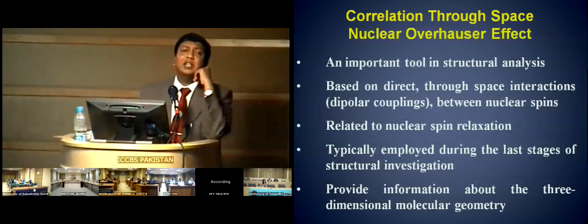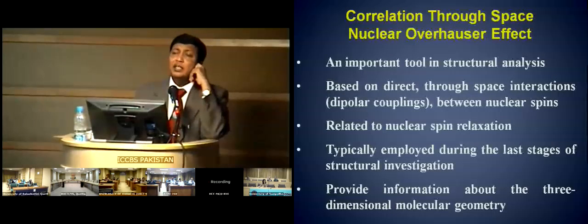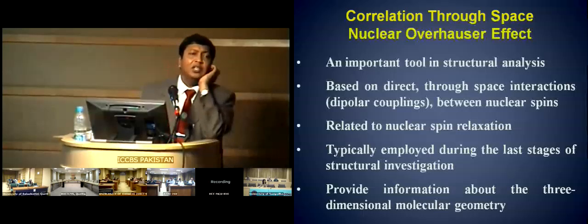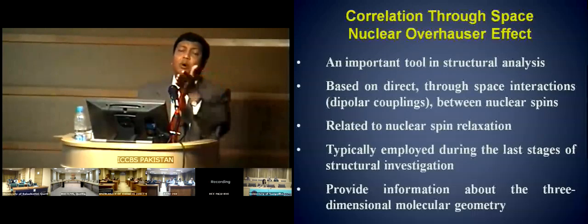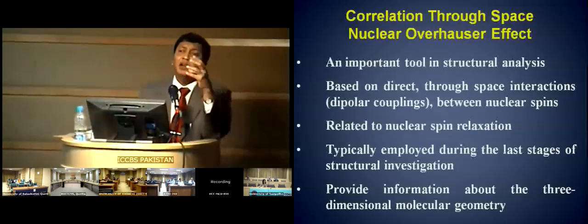What we have done, we just learned how to put proton, carbon, carbon, carbon together, link them together. This is a gross structure which has no conformation. This is a connectivity structure. This is not a real structure. The real structure requires three-dimensionality because except a few molecules, most of the organic molecules and almost all of the biochemicals are three-dimensional structures. They have a third dimension. They have a conformation, they have a configuration, and this is missing.